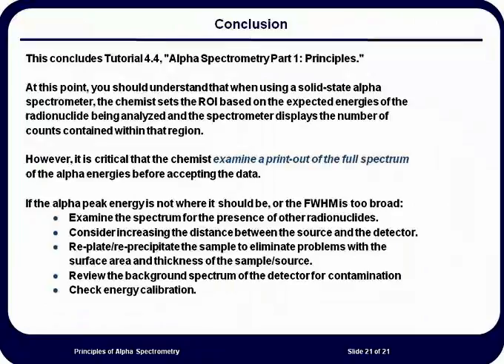Measurement of alpha spectra can be significantly impacted by the technique of the chemist in preparing the sample test source. Furthermore, the chemist should be able to examine the alpha spectrum and assess the adequacy of the individual peak resolution as well as the adequacy of the resolution between alpha peaks. One of the most critical aspects of the sample preparation process is ensuring the uniformity, dryness, and thinness of the sample test source. These parameters control the resolution of all the alpha peaks that are measured.